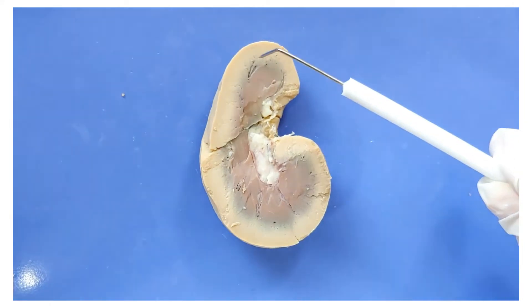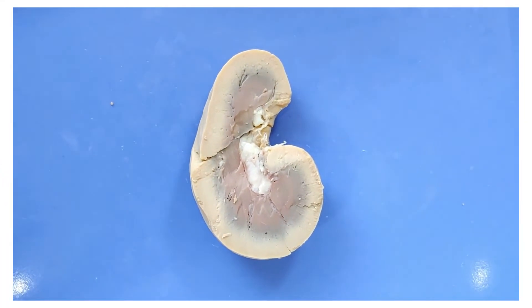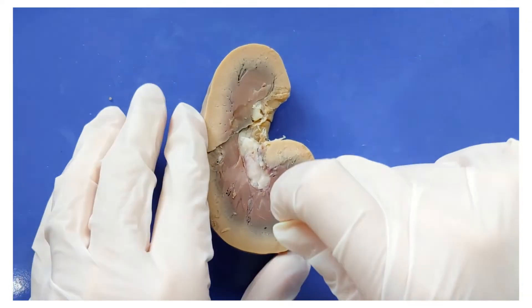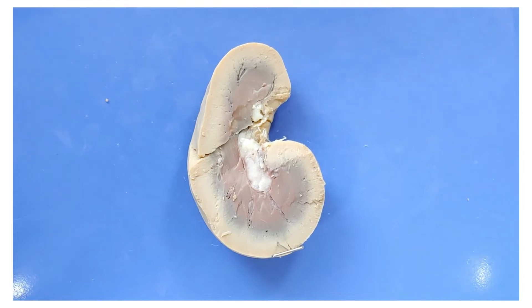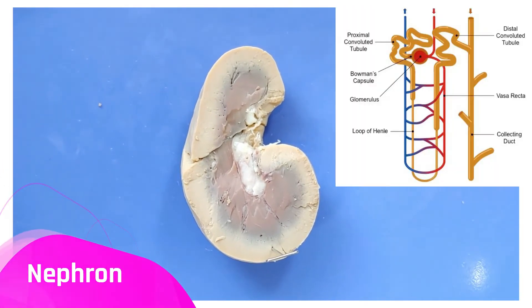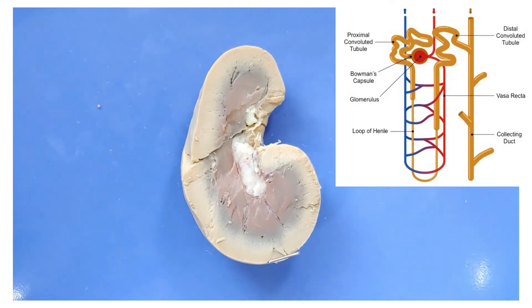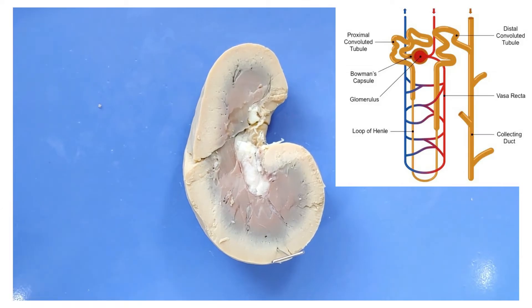This outer beige layer is called the cortex. I'll put a pin in here to mark the area. The functional unit of the kidney is a structure called the nephron. Blood first enters the nephron here in the cortex through a structure called the glomerulus. The glomerulus is kind of like a sieve.